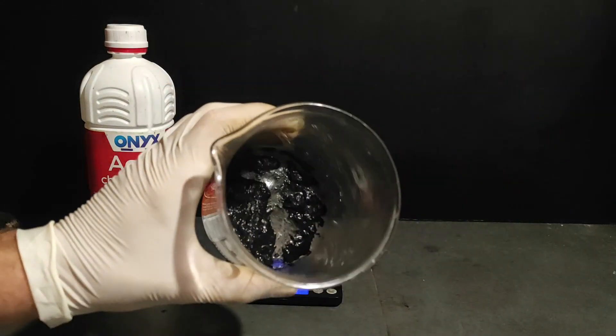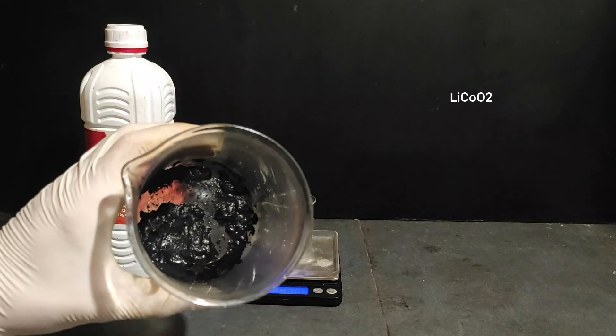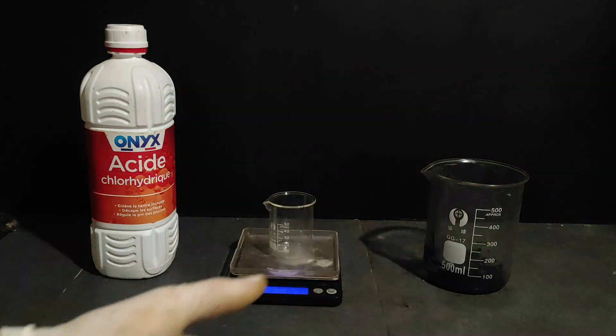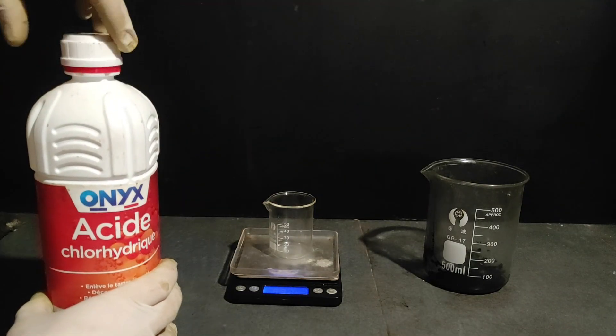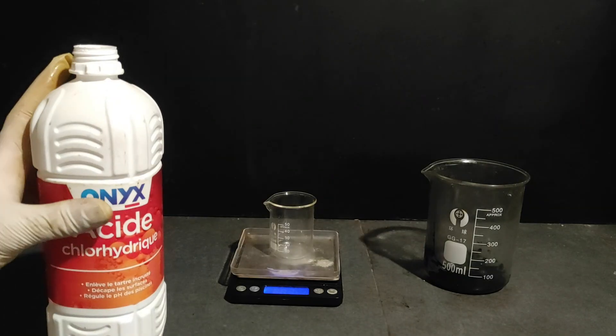So now we have our lithium cobalt dioxide right here, which has been washed about three times, so it's mostly free of aluminium. Now we're gonna measure 30 grams of this 23% hydrochloric acid to dissolve this oxide.